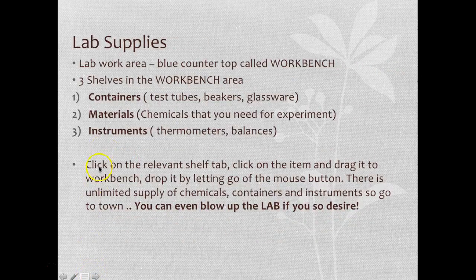So we talked about those three tabs, one for the containers, which is all the glassware, the materials, which is the chemicals, and then the instruments, which would be thermometers and balances and pH meters, etc. Okay. So there is an unlimited supply of chemicals, containers, instruments, and if you're not careful, you'll be able to even blow up the lab, but since it's in the virtual environment, no harm done.